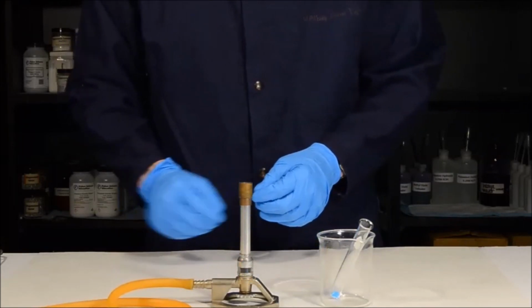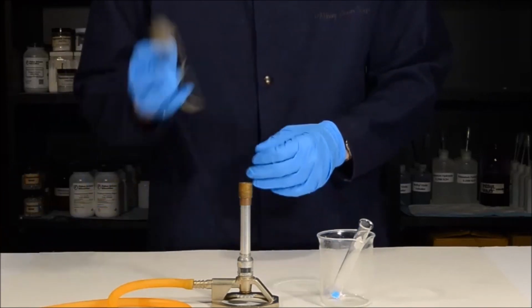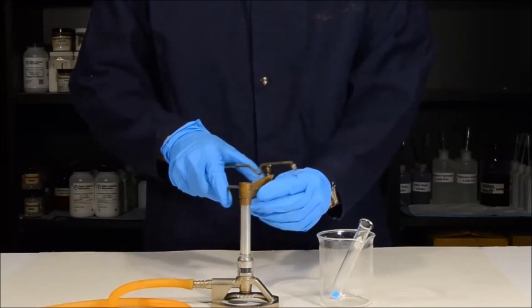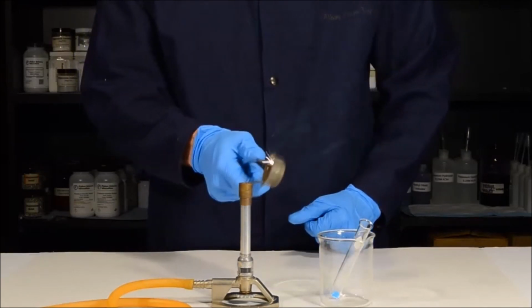Now that your Bunsen burner is ready to go, you're ready to turn on your gas. But before you do that, you want to make sure that your sparker works. In order to make sure the sparker works, you simply want to place your thumb on the arm that moves back and forth, and then swipe it across like this.